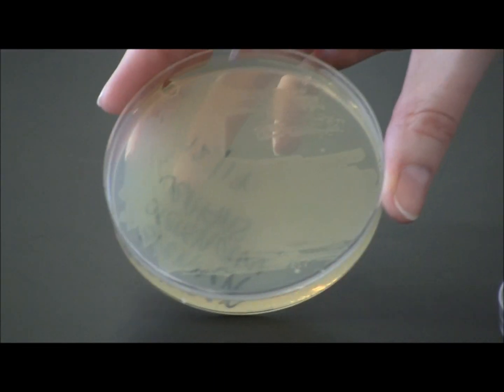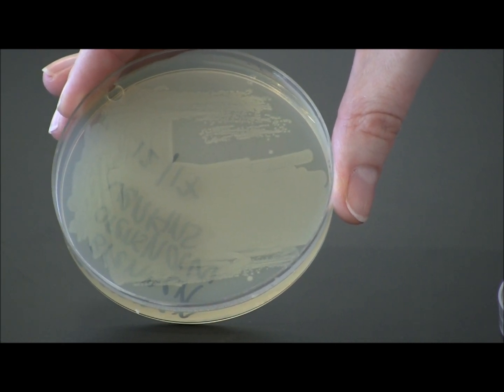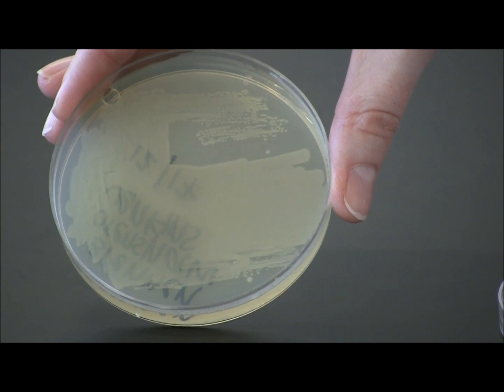This is an example of a plate that was not properly streaked. The problem may have been that the loop was not flamed properly in between each quadrant streak.